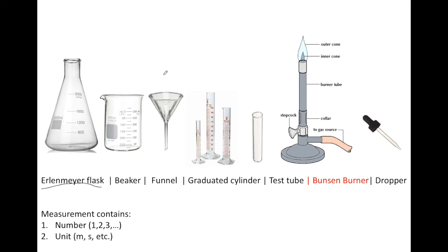This is the funnel. Basically, there's a special type of paper called filter paper, and you fold it in a special way and put it inside. When you pour, for example, sand water or dirt water in here, the particles will get filtered out while the liquid drops down here.